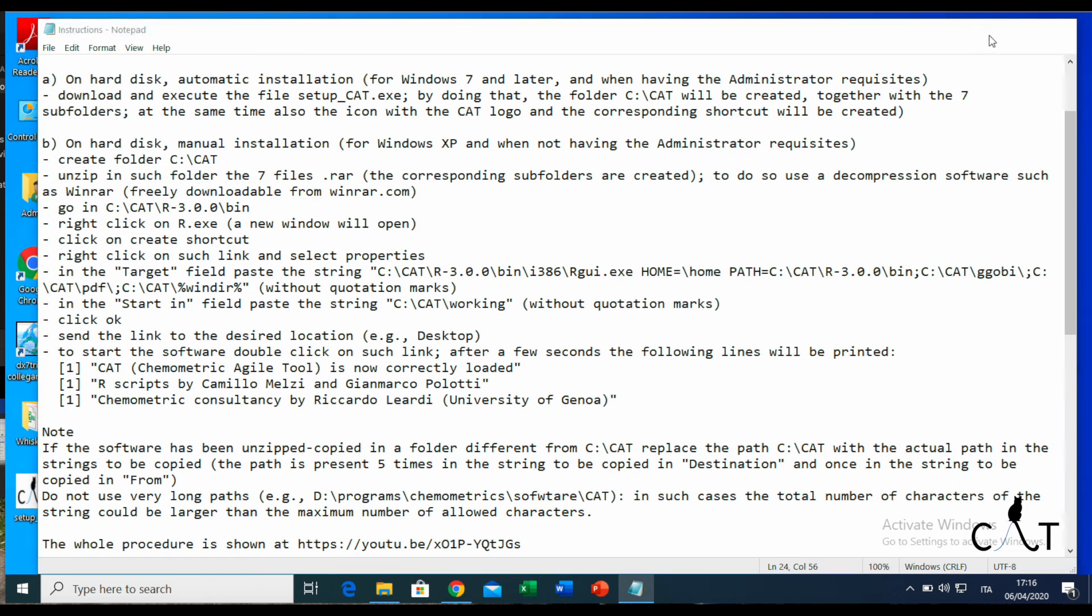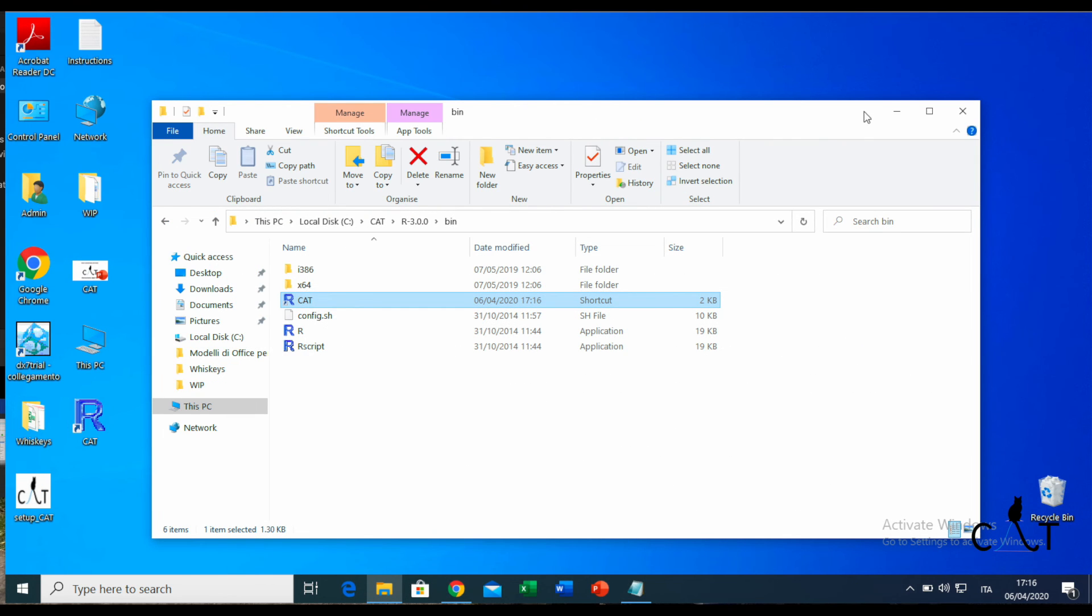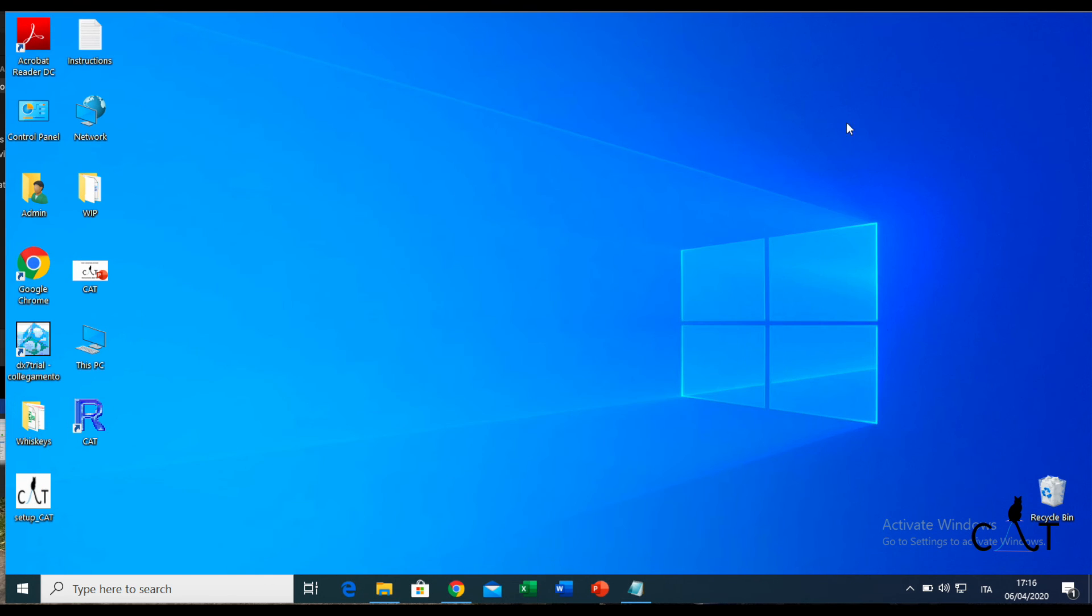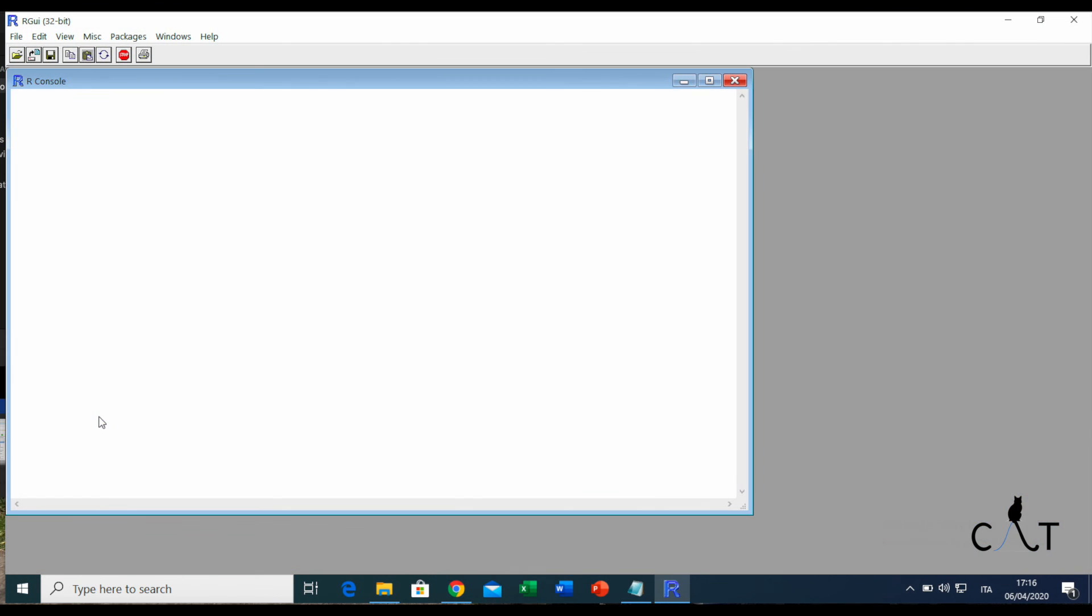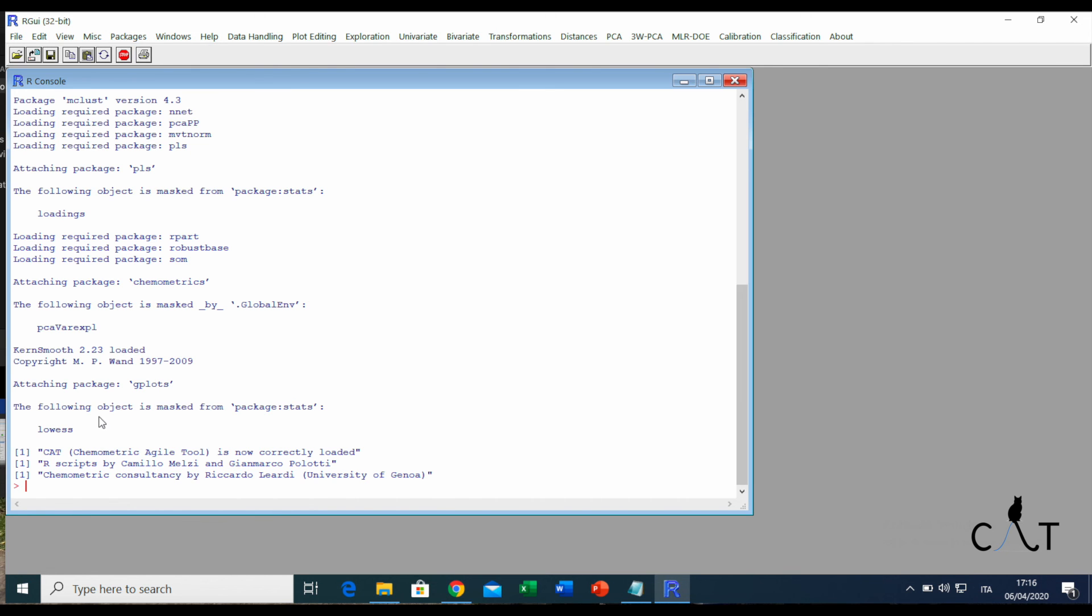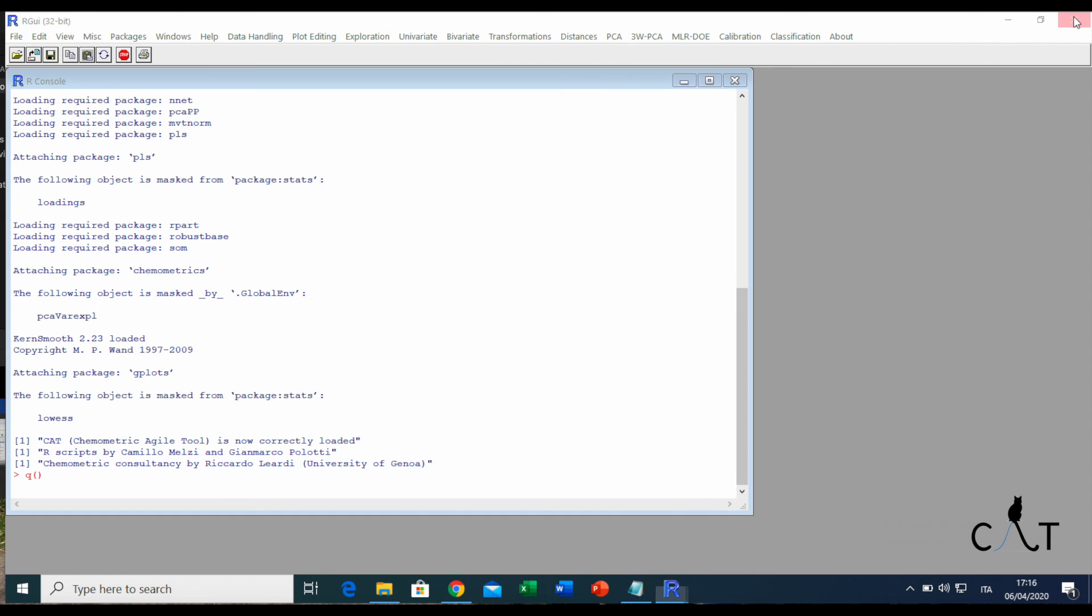Now, to start the software, we only need to double-click on such a link. It needs just a few seconds to start. And here we are. It works! Thank you very much, and see you at the next tutorial.